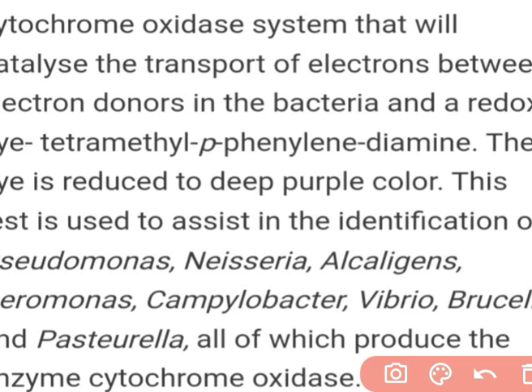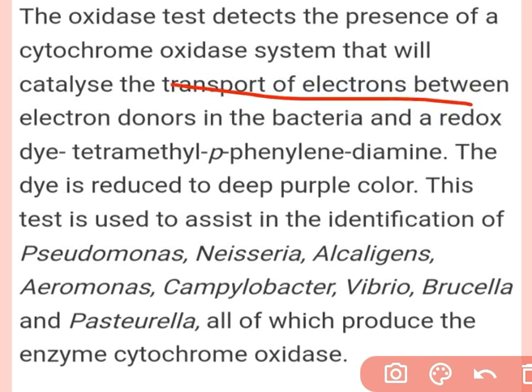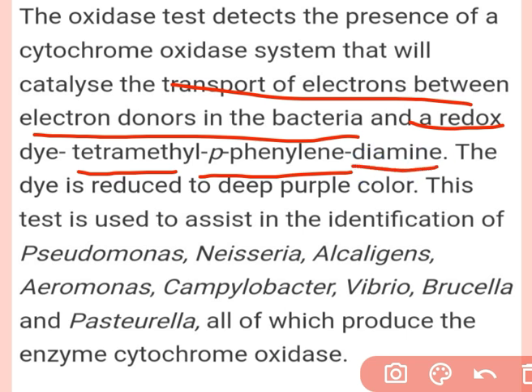The oxidase test detects the presence of a cytochrome oxidase system that will catalyze the transport of an electron between electron donors in bacteria and a redox dye, tetramethyl paraphenylene diamine.